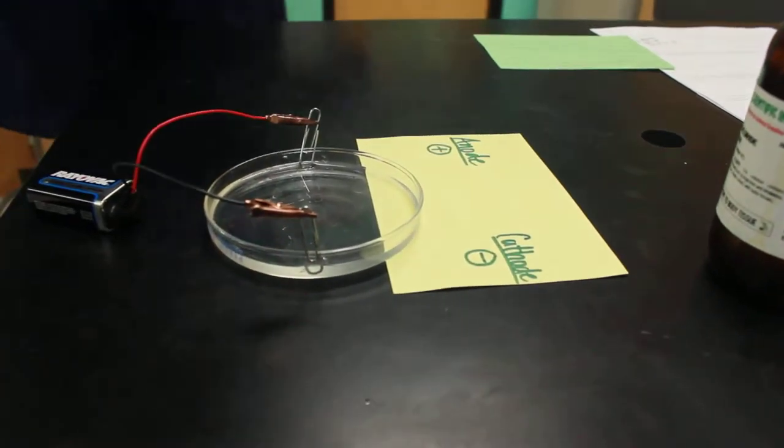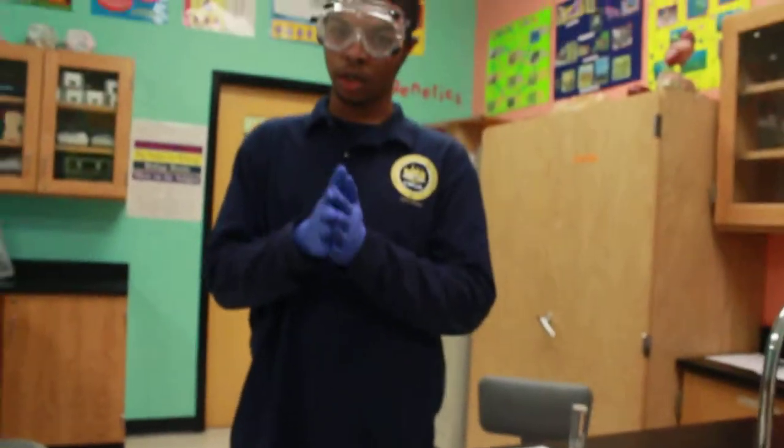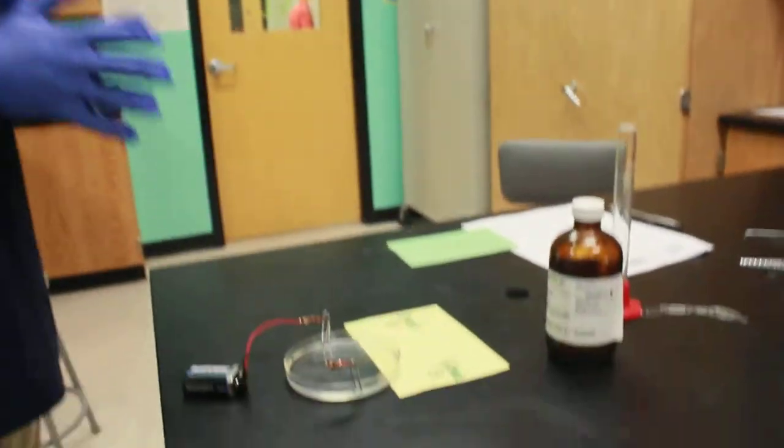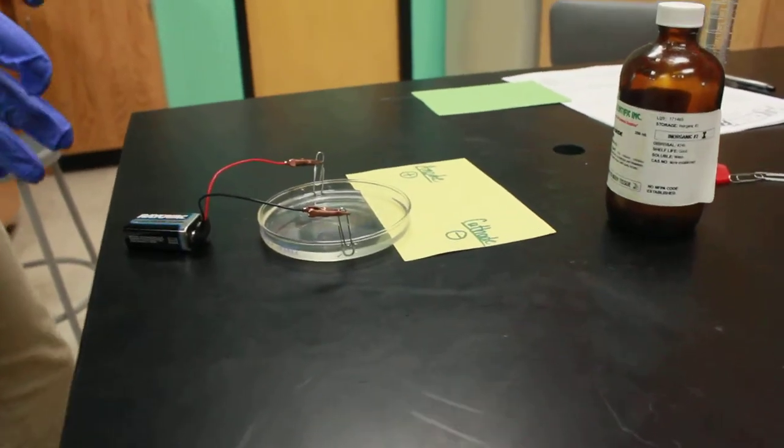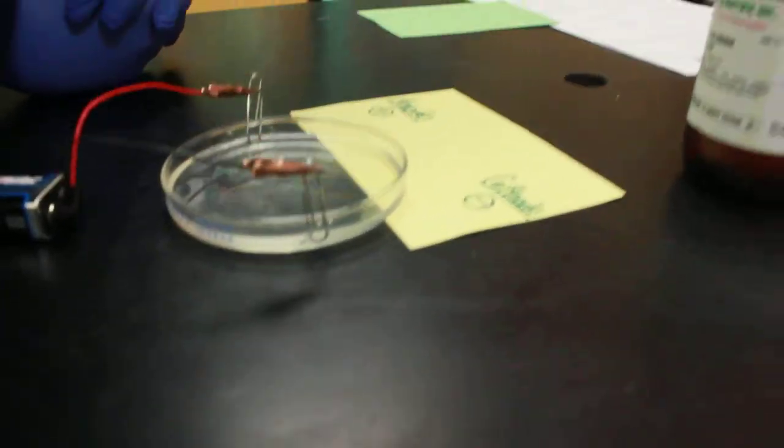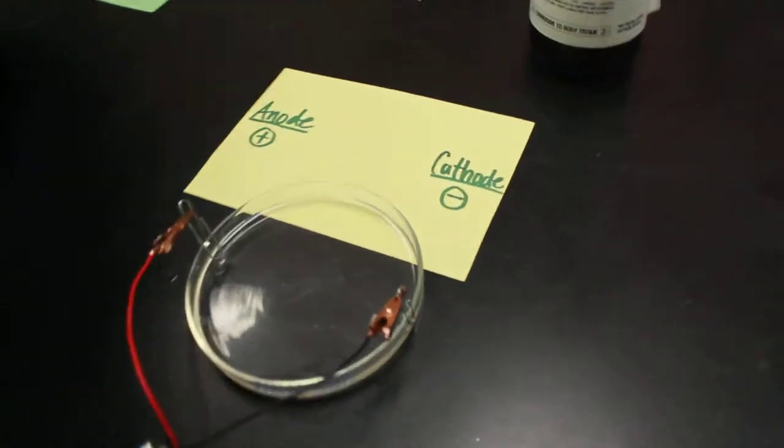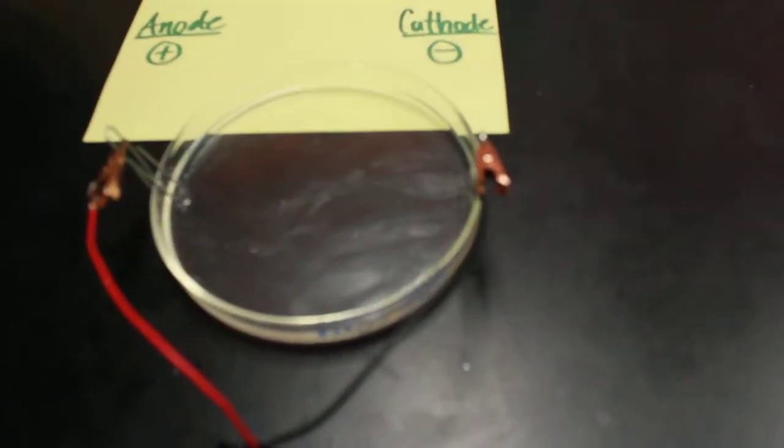Now, because this is an oxidation reduction reaction, this is going to show us the difference. So on the cathode, we will soon see, if you come close, you can see that it's starting to begin to create a little branch.